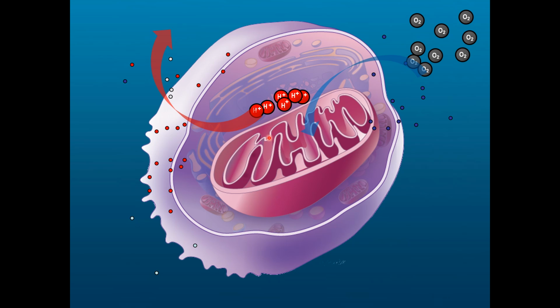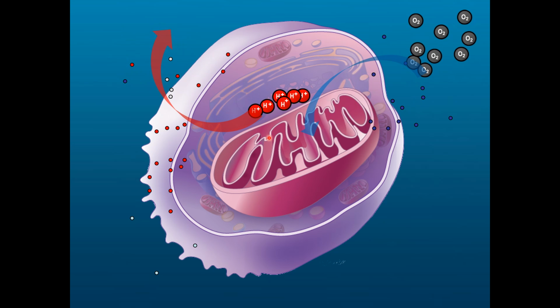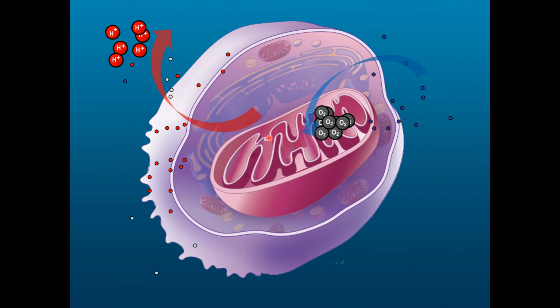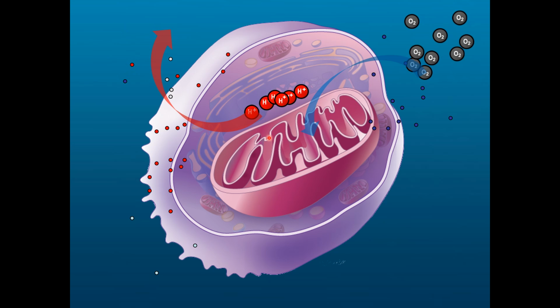But measuring living cells is not easy, because cells have to be alive to have energy. If we fix the cell or lyse the cell, we could not measure the living cell metabolism. And that is the reason why the Seahorse analyzer is the only instrument to measure the whole metabolism.